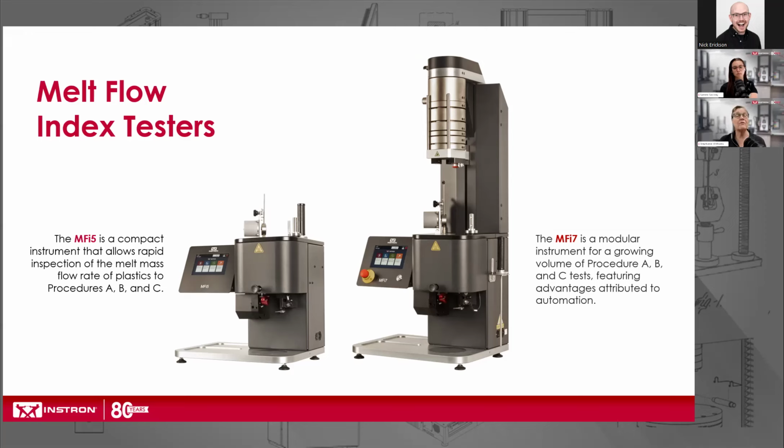If, however, your lab is more of an R&D lab, or perhaps you do a lot of different materials coming into the lab, you need a lot of different masses, you may want to consider a more automated system, such as the one on the right. These are systems that would have a load cell in addition to an encoder. The load cell would help with compacting materials and purging materials.